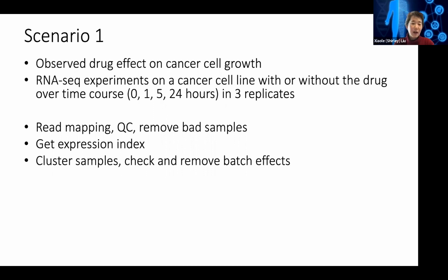And then you probably want to cluster the samples because remember, these are 3 biological replicates done on 3 different days. And so we want to see whether the samples are clustered, ideally, by with or without drug treatment, and also by time.